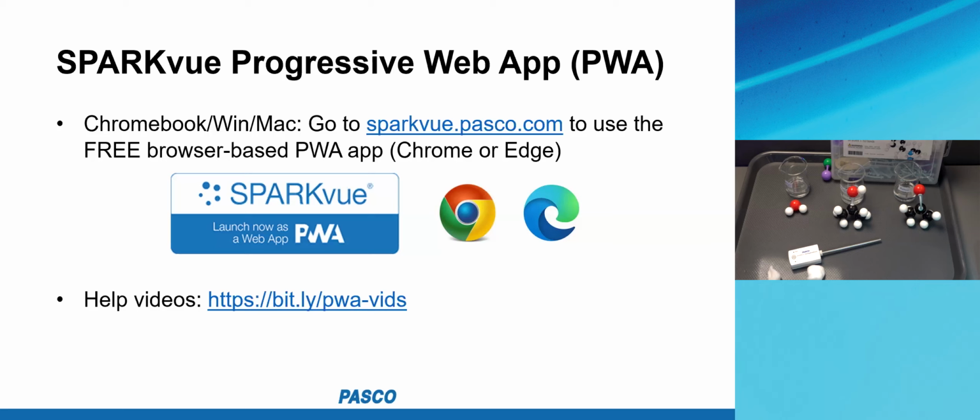But also, how do you get help with SPARKvue? How do you get help with the PWA version of SPARKvue? There's a specific link that I dropped into chat that goes over the differences and how do I do the things I know how to do in SPARKvue in the app version? How do I do that in the browser version?